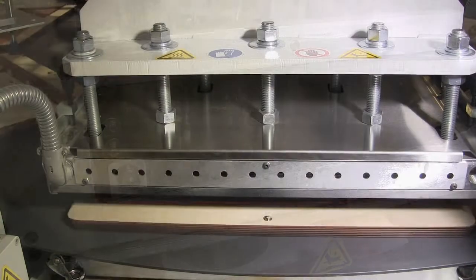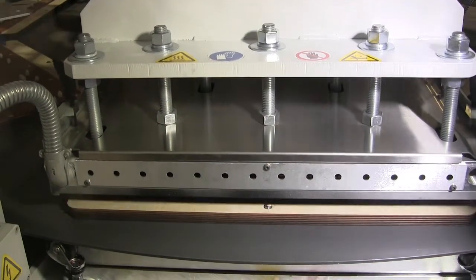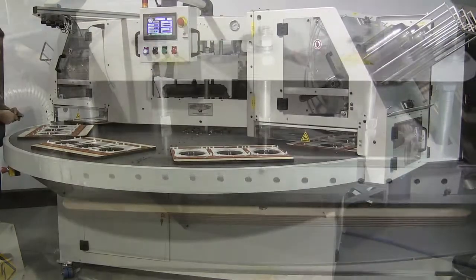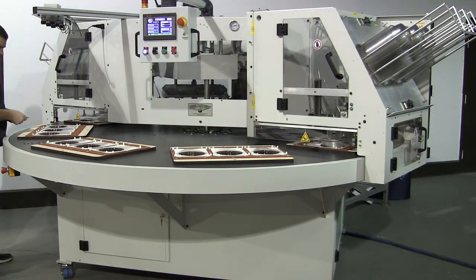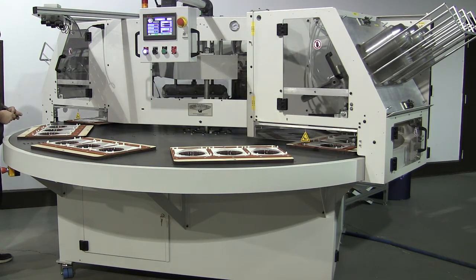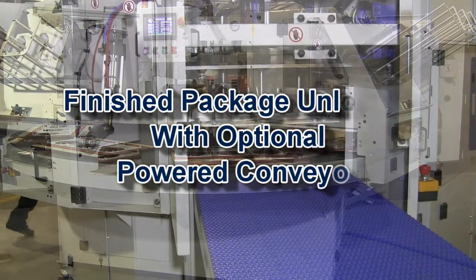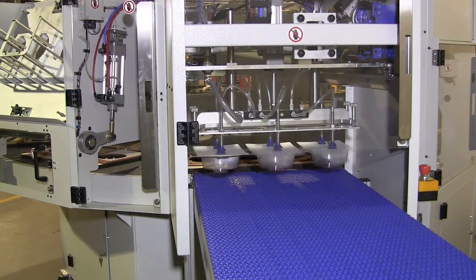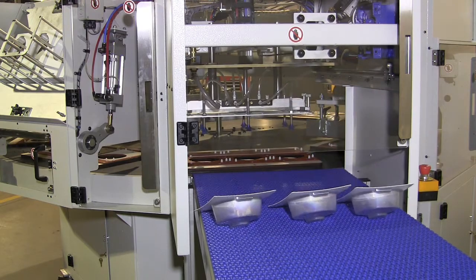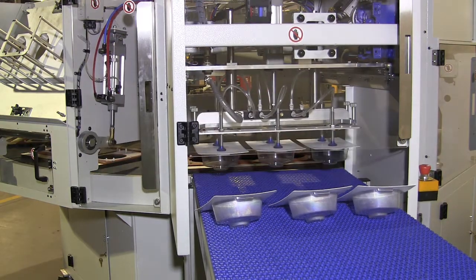Three automatic feeders and a finished package unloader greatly reduce the labor required to produce packages and allow increased operating speeds. A wide variety of optional features and automation are available for these machines to increase versatility and further reduce labor input, such as the package discharge to integrated conveyor as shown here.